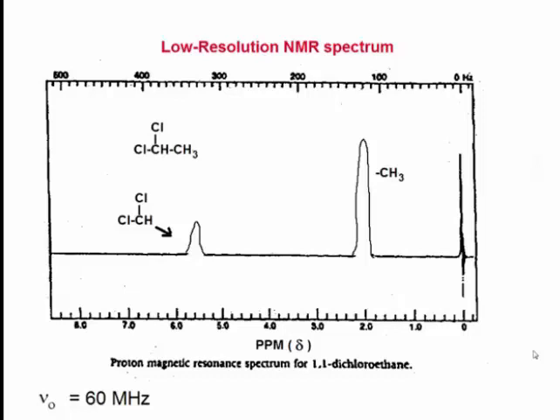Here's another spectrum. This is a spectrum of 1,1-dichloroethane. This particular spectrum is done also at low resolution.